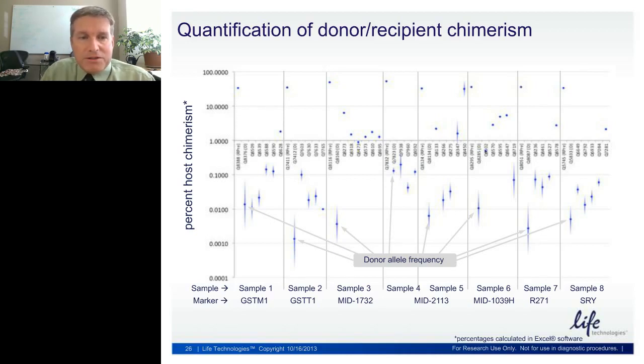And then each one of the points following that are the recipient's blood genotype at various times after the transplant. And you can see that some patients are having a relapse, and some patients did not have a relapse. So this is a very, very good way for quantifying the amount of chimerism present in these patients by just making use of digital PCR.